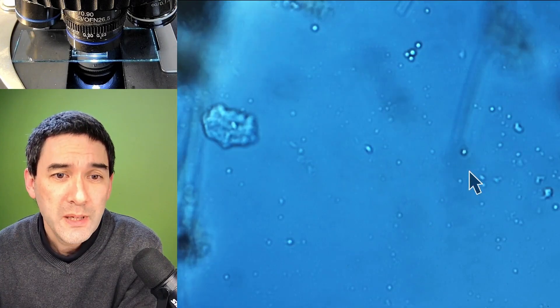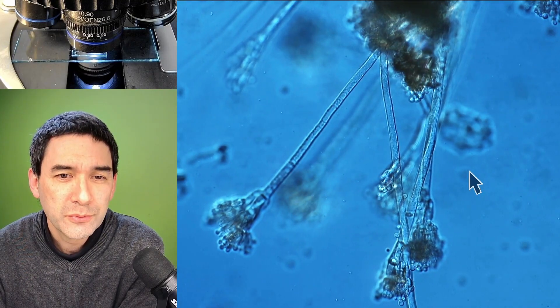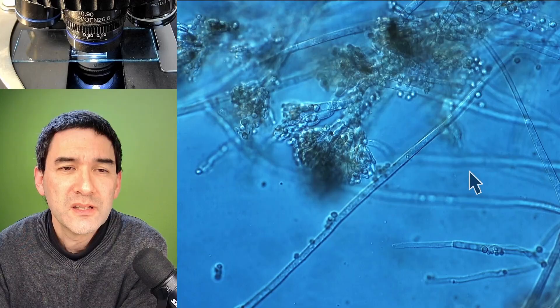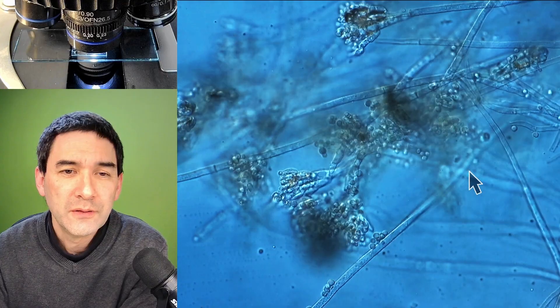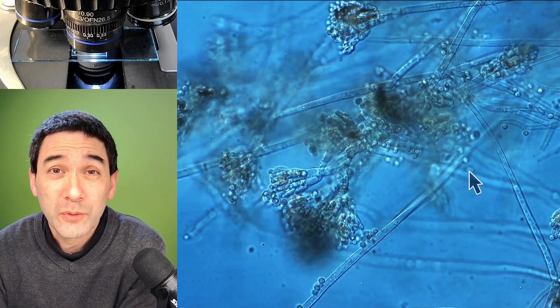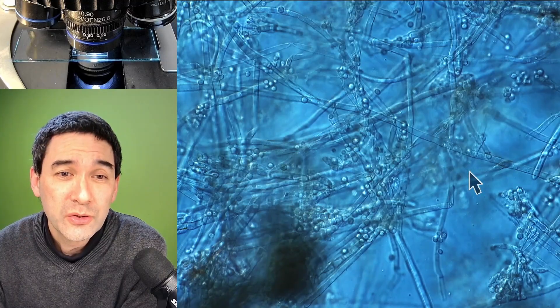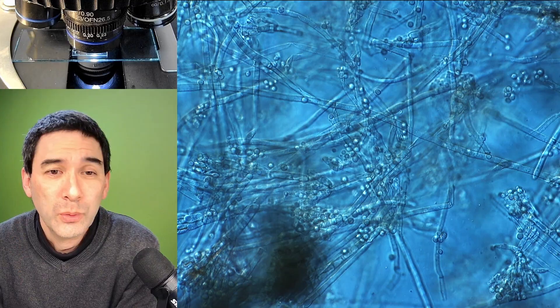There are millions and millions of spores. This means that this mold will not only produce toxins that spread throughout the food, but if you're not careful, the mold will also spread inside the refrigerator or wherever you kept the food, and it's going to start infecting other intact foods. So that's why it's very important to always immediately discard and throw away moldy food.